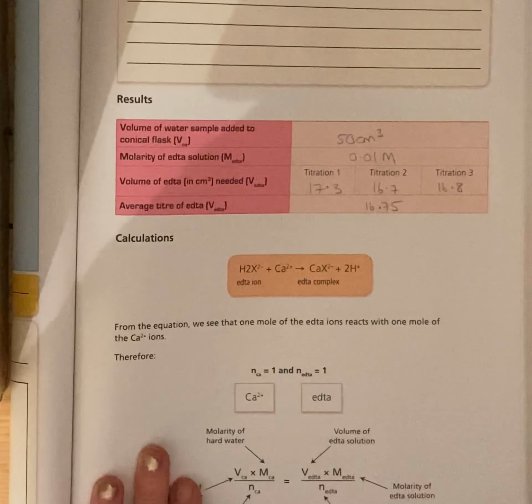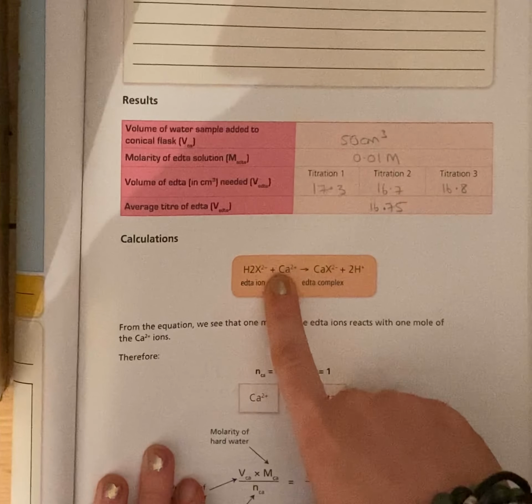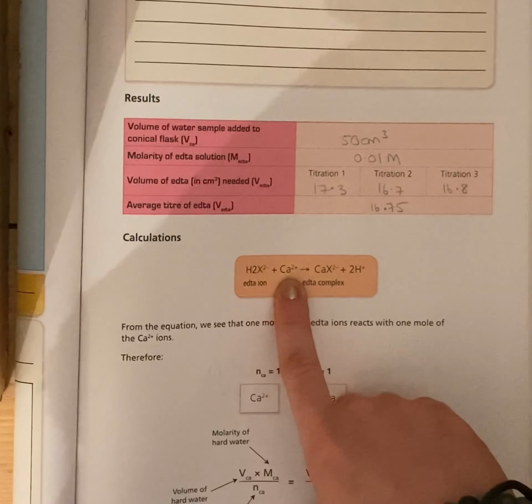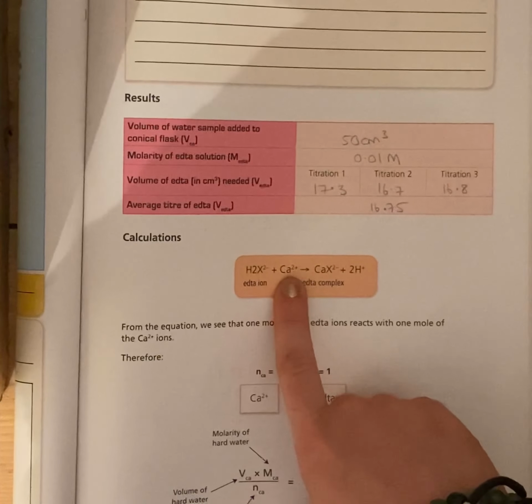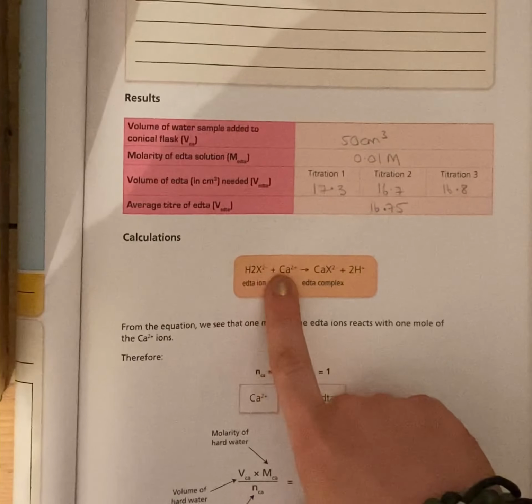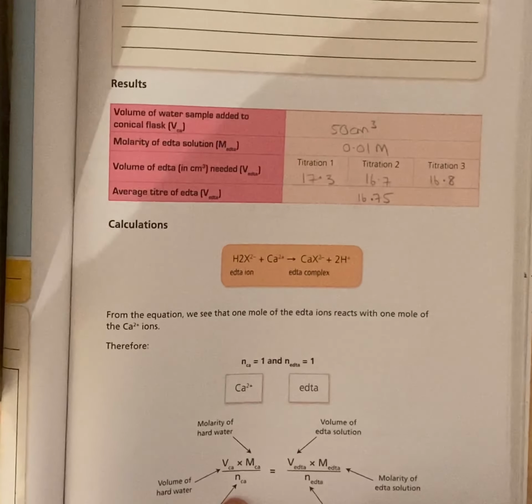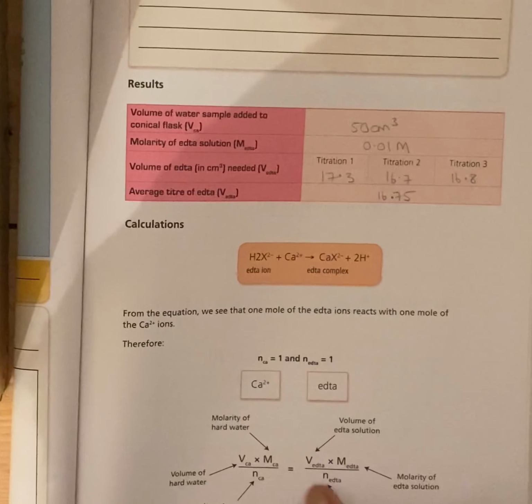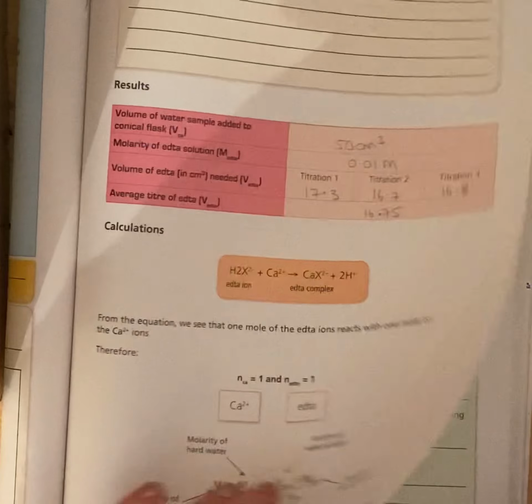Now, for this equation, we can see the EDTA ion, and then we can also see the hardness within the water, which is caused by calcium ions or magnesium ions. So this is going to react with the calcium ions, so it reacts in a 1-to-1 ratio. So for our equation down here, we can see that nCa and nEDTA will both be 1s, so 1 and 1. Okay, so we're just going to use that on the next page.